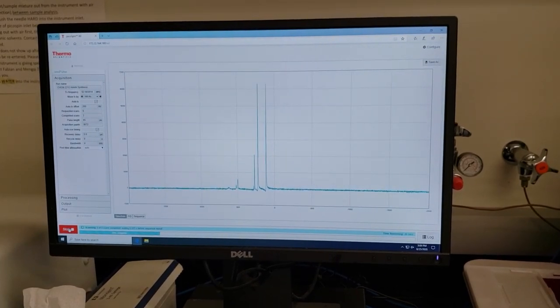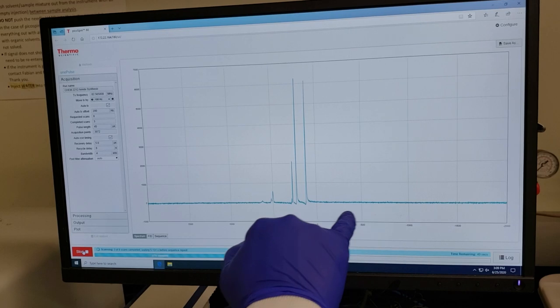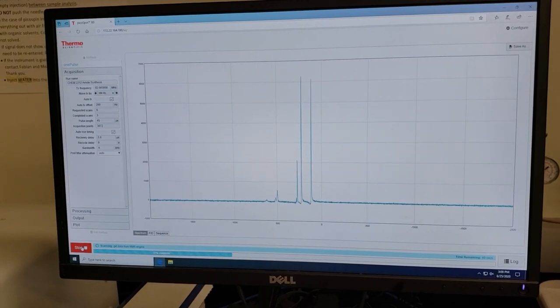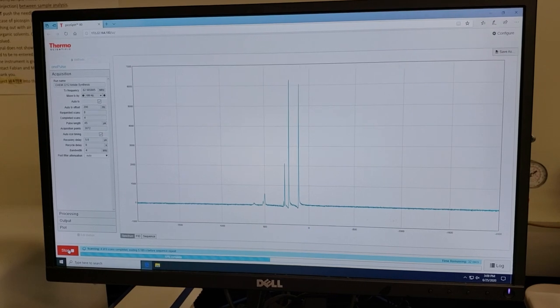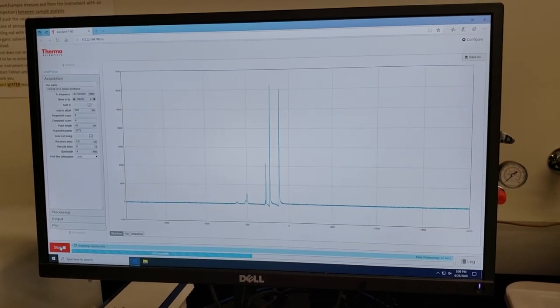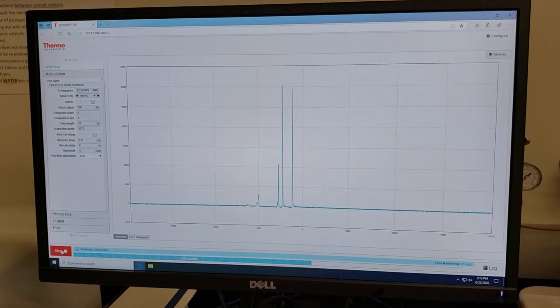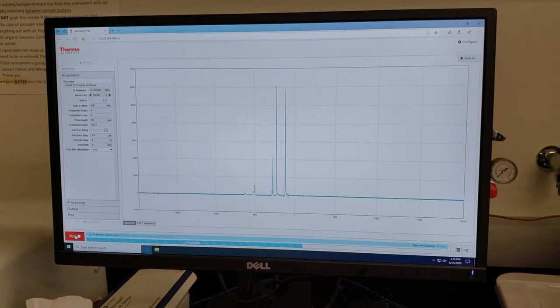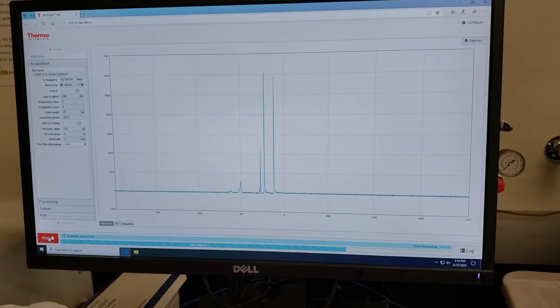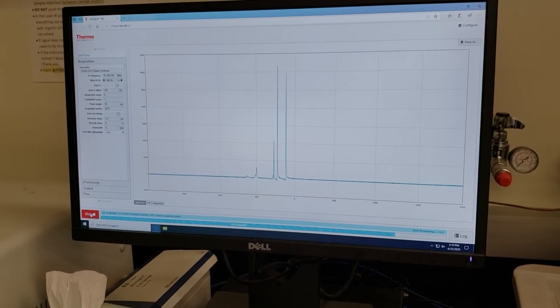Now remember, each successful pass will clear up the noise that you see in the baseline here. So we're going to change our phasing. Our phasing is going to clear up and the noise is going to resolve itself. That's why we do 8 scans. It's a refinement over the course of multiple scans. Okay, we're about halfway done at this point. There, our phasing came into line. Almost 7 of 8 scans finished.